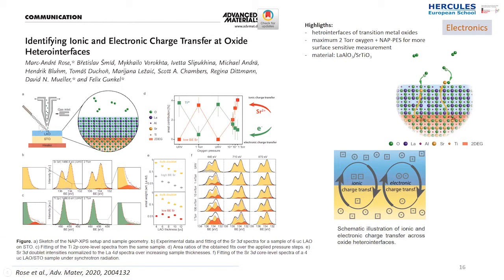So the strontium atoms that are under the subsurface were observed to be on the surface with specific reaction conditions, when the material is surrounded by a specific gas, in this case oxygen. So you can see that after introducing the gas inside the chamber, you can observe a new species.